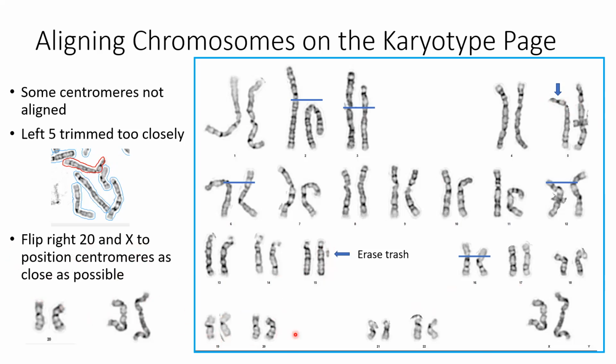So you see, this is a good example, and we can fairly easily do it on a 20. Yeah, there are the 3 bands, 1, 2, 3, here's a centromere, everything looks pretty close. But on the longer chromosomes and the higher resolution, this would drive you nuts trying to analyze it. And then this is just a better look and a better analysis tool if this X is flipped, so this way instead of this way. So that is the end of that.